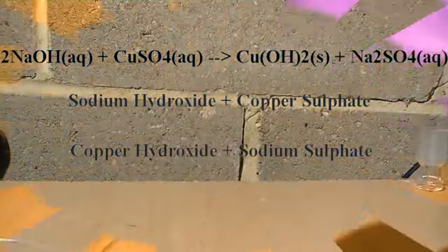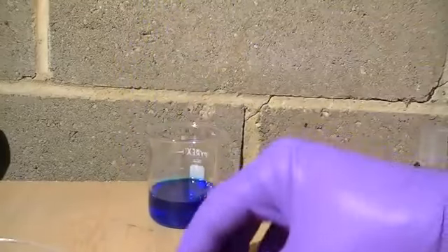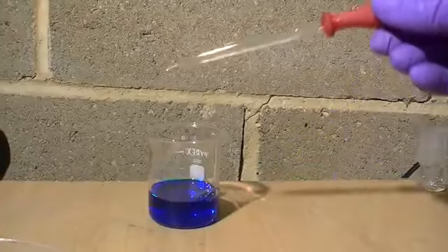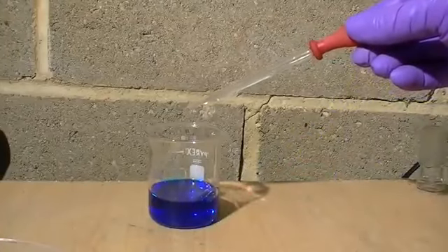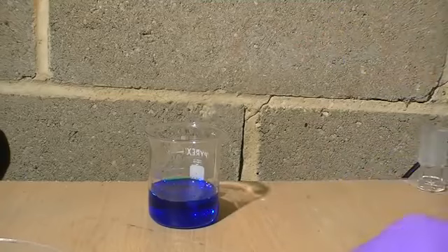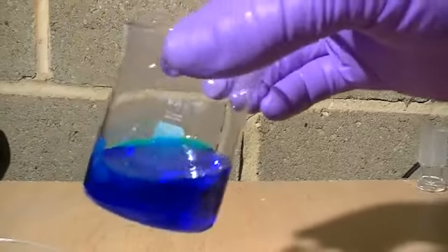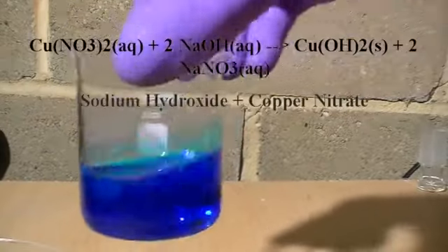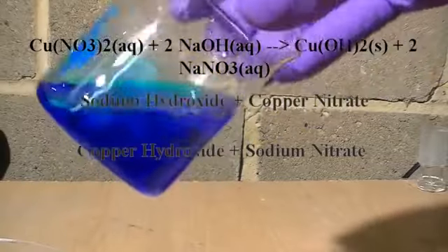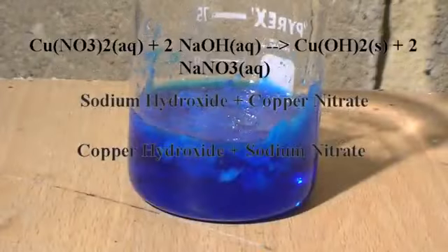In the next demonstration, we're going to look at the reaction between copper nitrate solution and sodium hydroxide. Concentrated sodium hydroxide solution is going to be pipetted into the blue copper nitrate solution, and when these solutions meet, again we can see a precipitate is formed, and this precipitate is again copper hydroxide, and the double displacement reaction has also formed sodium nitrate, which remains in solution.